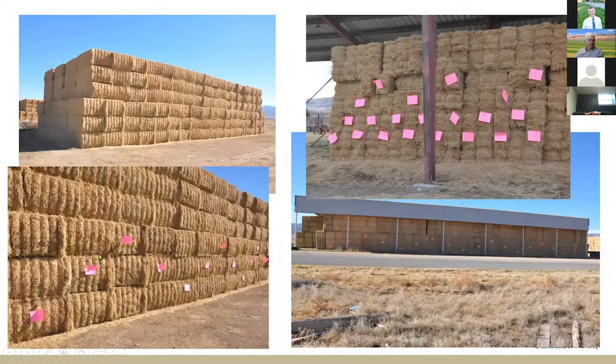But here's maybe an example of some ways you could find a random pattern that you could use on a stack of hay. If you're only sampling maybe a couple of hundred bales of small string, 2 string bales in the upper right, maybe you're pulling 3 or 4 cores out of each bale wagon load. If you're sampling a stack that's got 500 or 600 tons in it, like the one on the left, then maybe go in a zigzaggy fashion down through the side. Or the lower photo on the lower right, again, down the side of the stack.